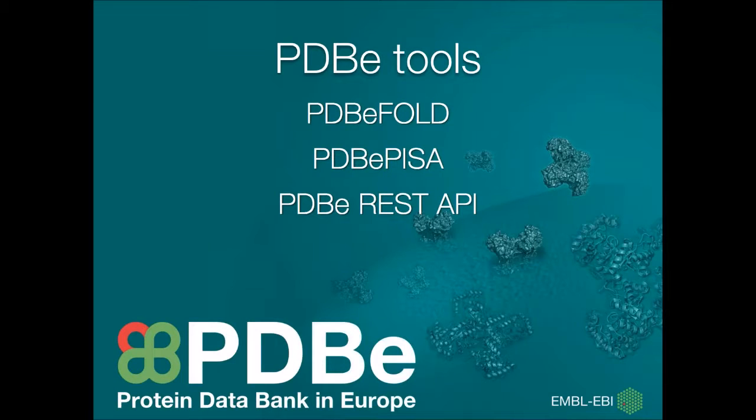There are a number of tools that we have developed here at the PDBe that you may find useful to your own research.